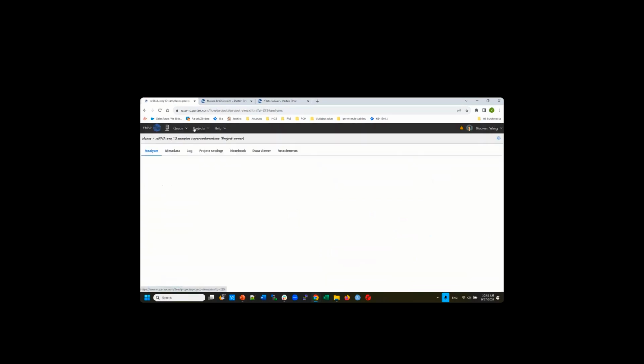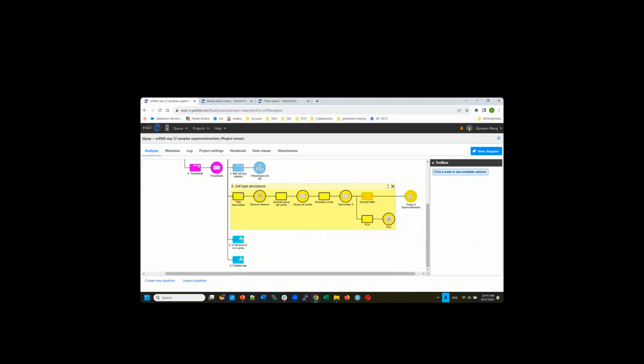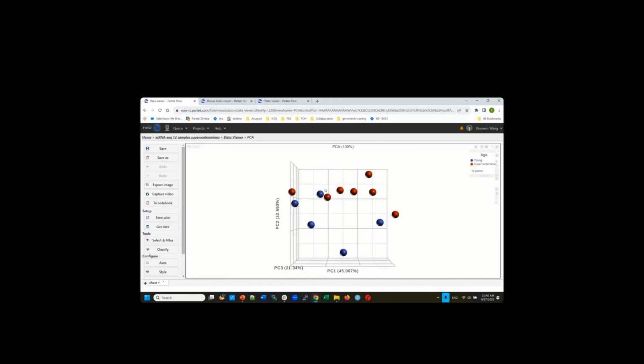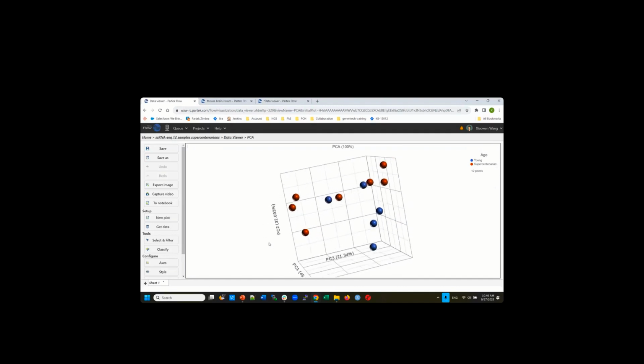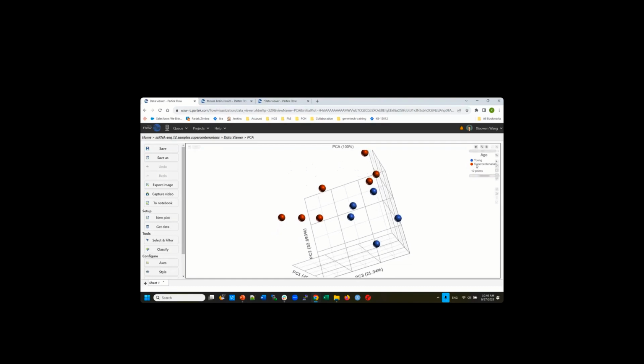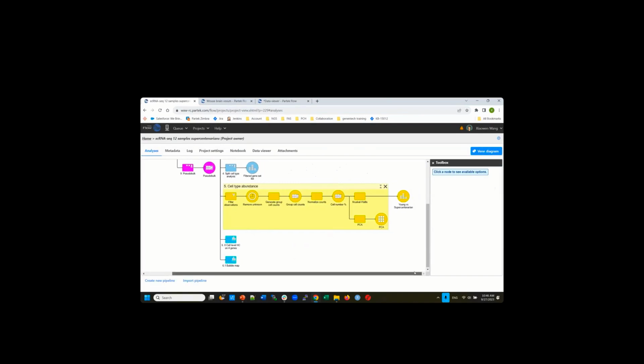Okay, you can look at, for example, PCA of this. This is at a sample level now. It's not single cell, because you look at the number for each sample. And based on PCA, you might see there's some separation. It depends on what angle. From this angle I can see the separation of young versus old, and then it depends on what statistical test you want to use.